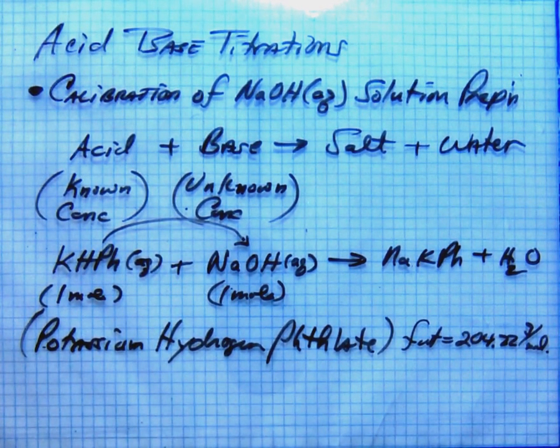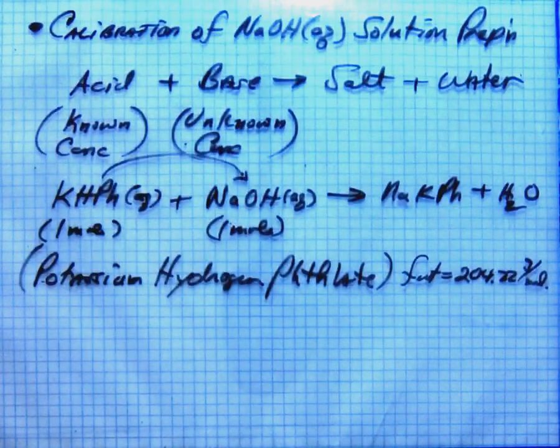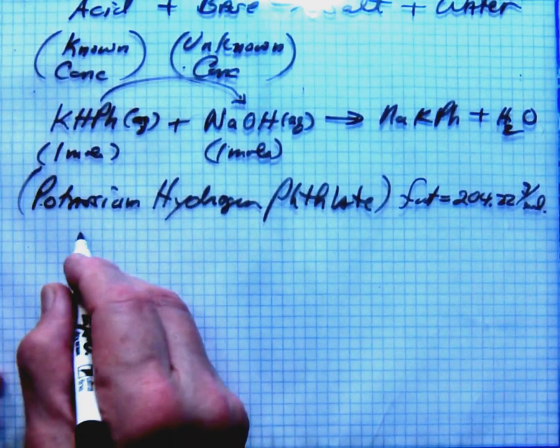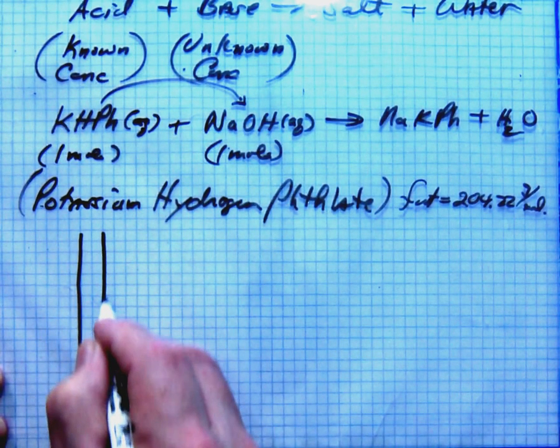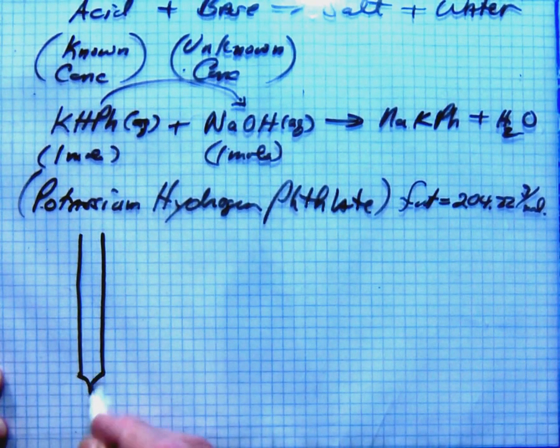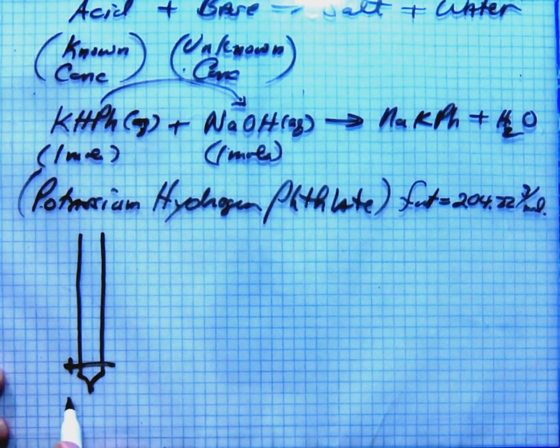Now, okay, so this is going to be a titration, verify. What we're going to do is set up a titration system, and I will have all this Tuesday.